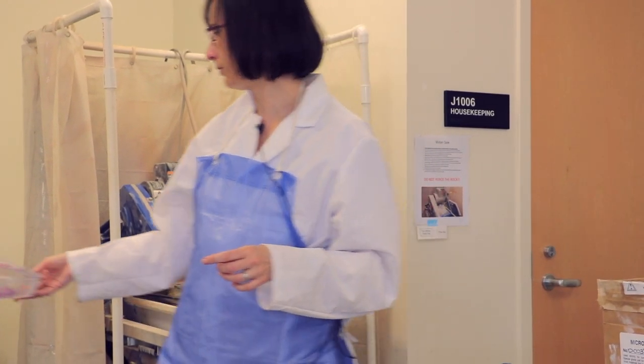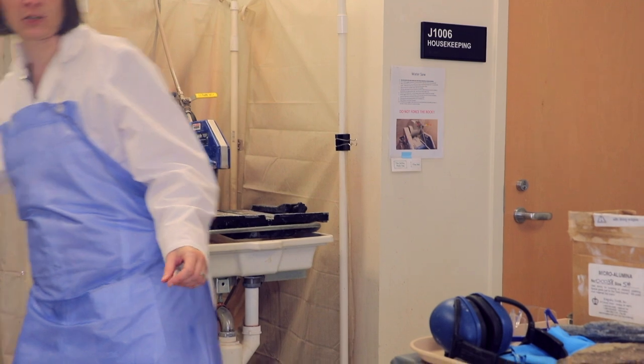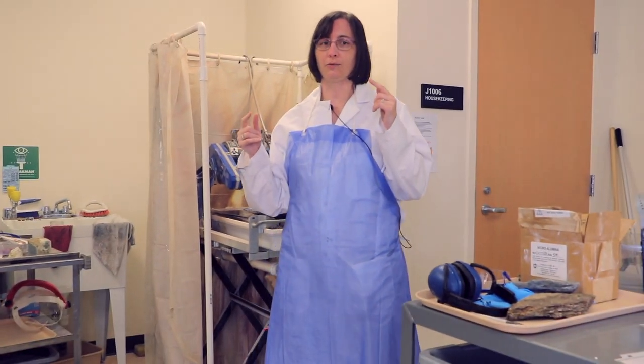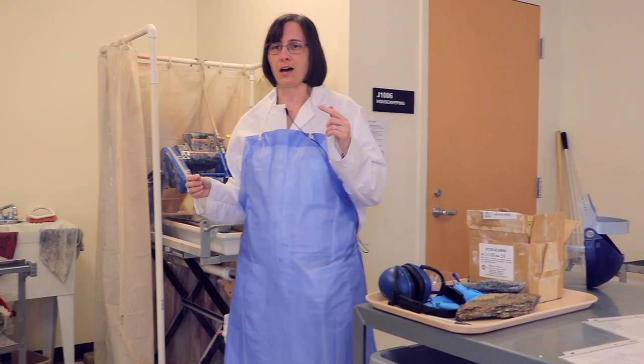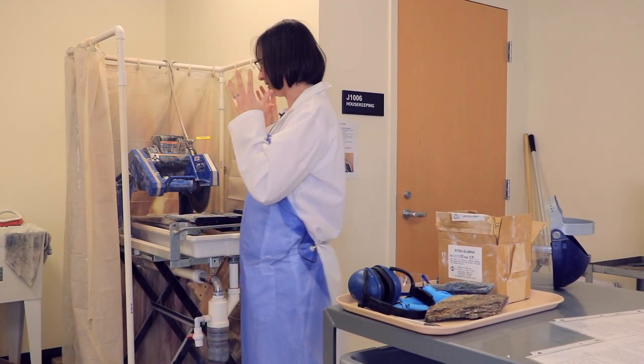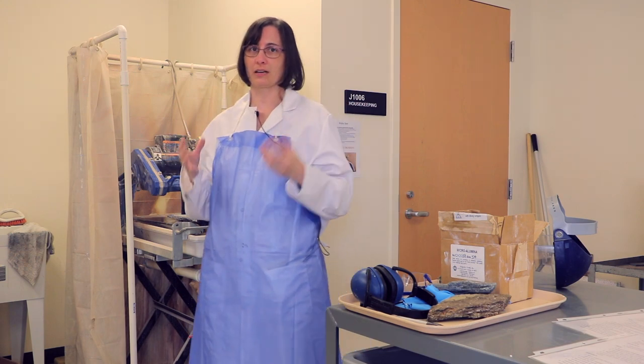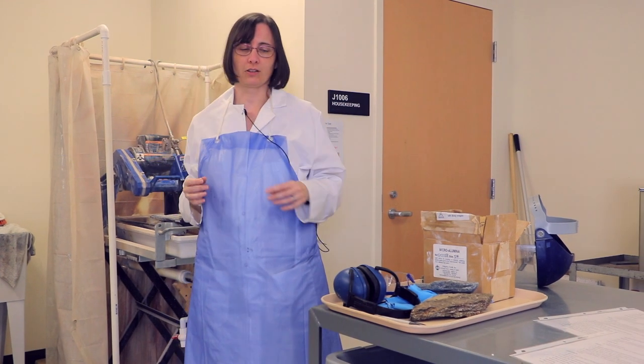That's somewhat of a personal preference, but it is important especially with the big rock saw to use some sort of ear protection because it is very loud, and over time, since your face and head is right next to the saw, it will cause hearing damage if you don't protect your ears correctly.